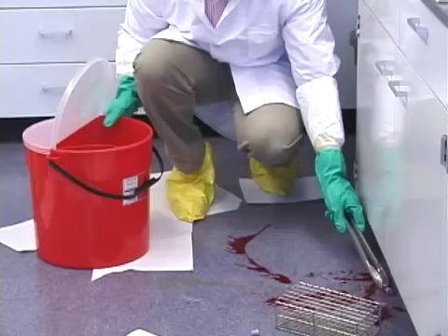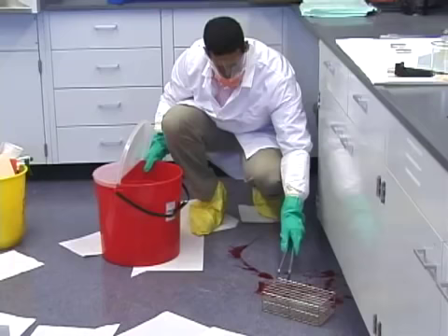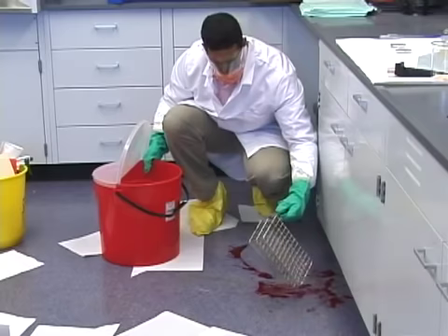Using tongs, a dustpan, or pieces of cardboard, pick up the sharps and dispose of them in a sharps container. Never use your hands to pick up sharps. Set aside any contaminated equipment for later decontamination.